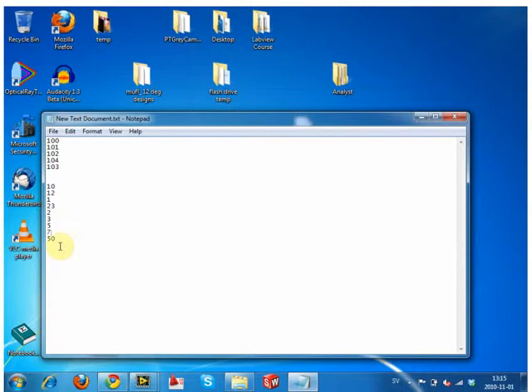So in this case, we're analyzing numbers that were written from a program that LR wrote, and he doesn't zero pad file names. He writes them 1, 2, 3, etc. But if we tell it to order them, it'll order them in this manner.